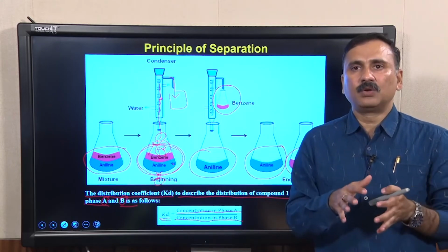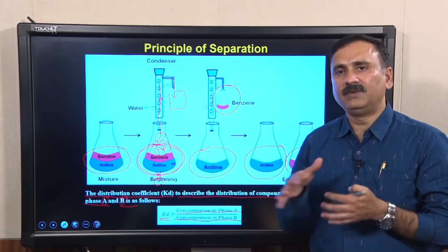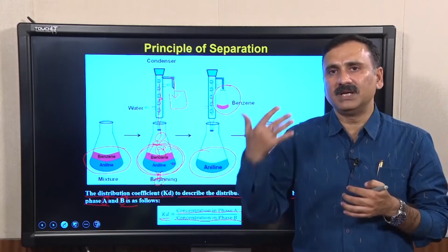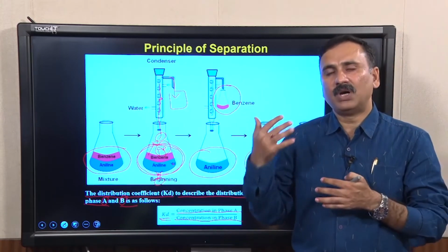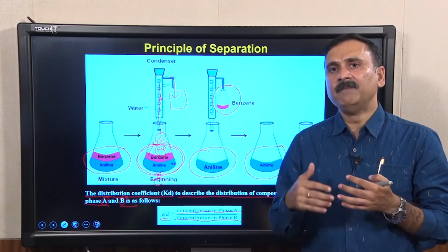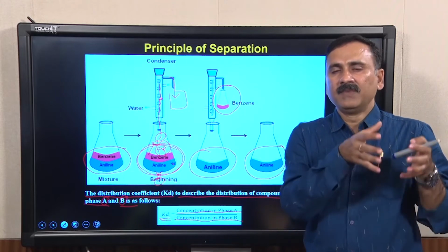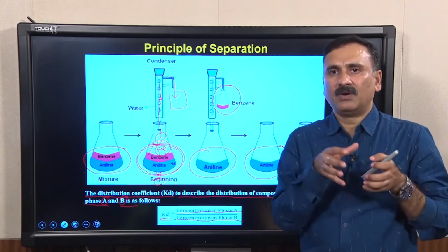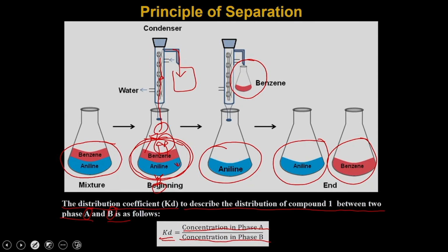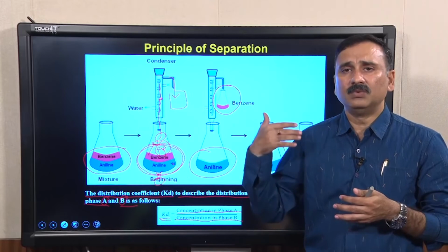It is also not a fixed number, because as soon as you change the pair of compounds, or as soon as you change the conditions, the distribution of the molecules is also going to be different between the phases. So, the distribution coefficient depends on the compounds which are present in the mixture, and it is a dynamic number which depends on the way the compound is going to be distributed into the different phases.